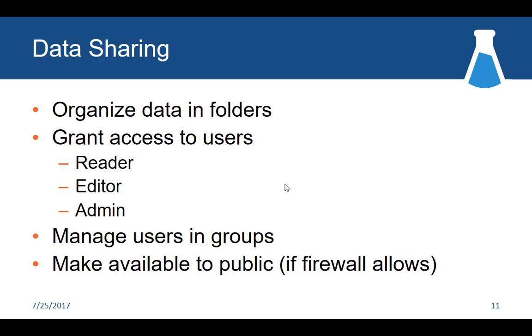Data sharing. So I kind of hinted at some of the different levels of access you might have to Panorama. You can keep your data private just to you. Only your account can see it. You can make it so that you're the only one who can edit it, but maybe other people in the lab can read it. Or you might have people that you trust to go ahead and upload new Skyline documents. And if other people can get to your server, that is, there's not a firewall between them and the Panorama instance, you can make that data fully public if you want to. So there's no requirement that you do that either on your own installation or on Panorama Web.